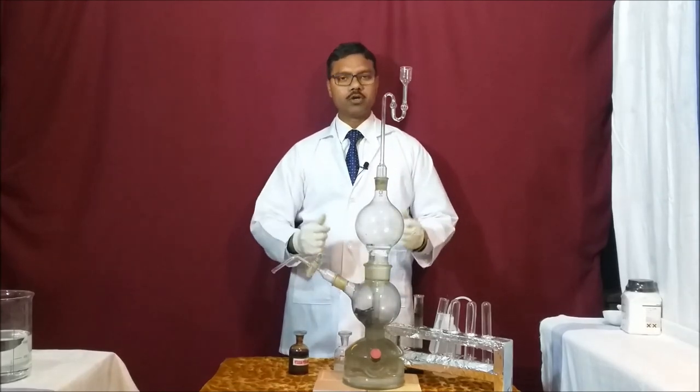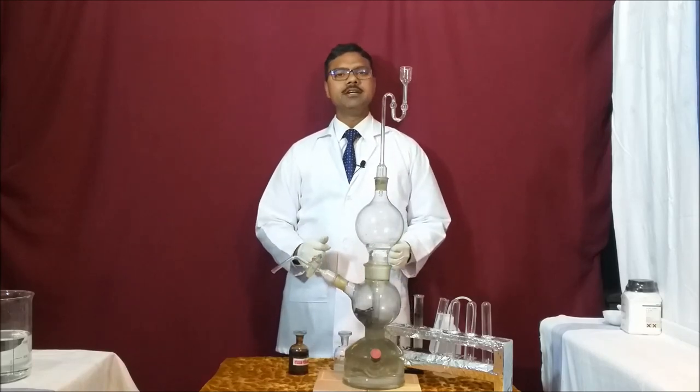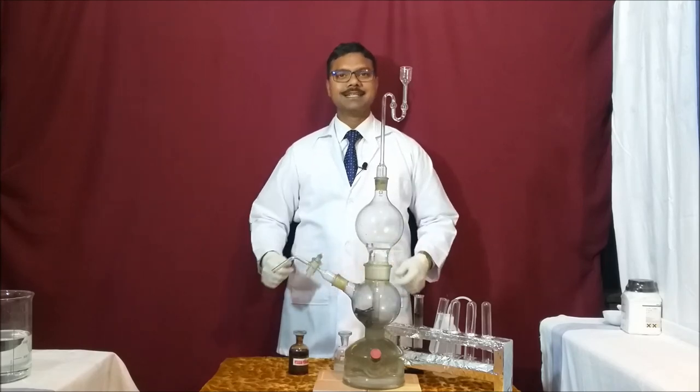This is how we confirm that the gas produced is H₂S gas. This gas is used in the chemistry laboratory for different types of tests — basically for the identification of lead and the identification of zinc for the basic radicals. Thank you very much.